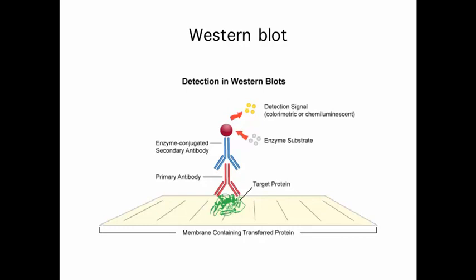So in this case, we're using bovine serum albumin. It's a very non-specific protein. Some labs use non-fat milk because milk has casein proteins in there. So it can be any type of protein as long as it will not react with your antibodies. So for example, you would not be able to use chicken general proteins because the whole gamut of chicken general proteins will have some aldolase in there, so you'd be getting some cross reactivity between general chicken proteins that you would have added to theoretically block with the availability of aldolase in non-specific locations. So you add a protein that is designed not to react with your antibody.